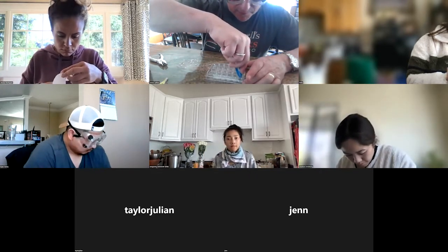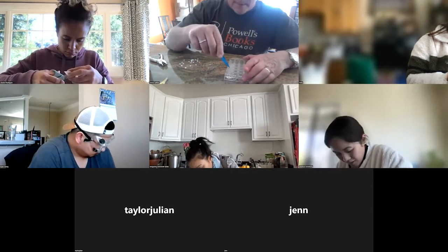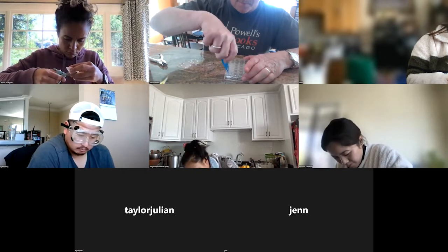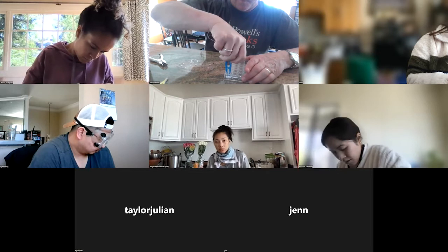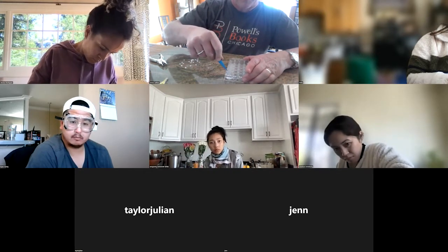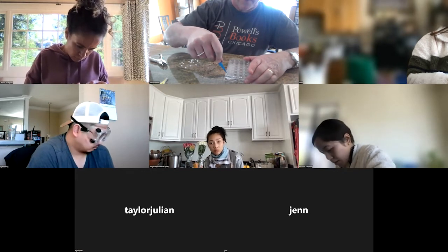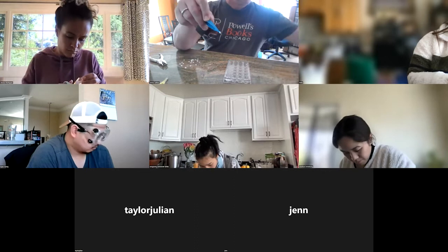Getting it out might be a little tricky. There we go. And then just dab it on the side. So now you've got a nice wet disc.